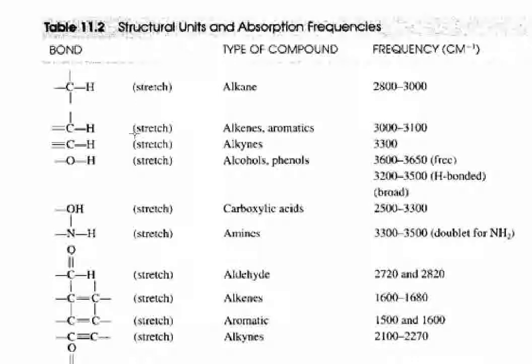If we look at the third entry here, this is an alkynyl CH. Well, the alkynyl CH is even a tighter bond than the double. Therefore, not surprisingly, the frequency of this alkynyl CH is even higher than the alkenyl CH. It has an average of about 3300 wave numbers.